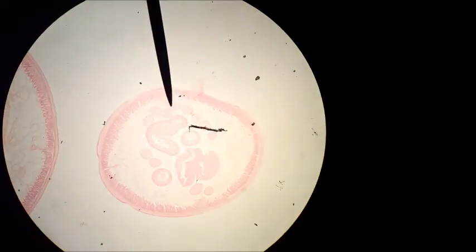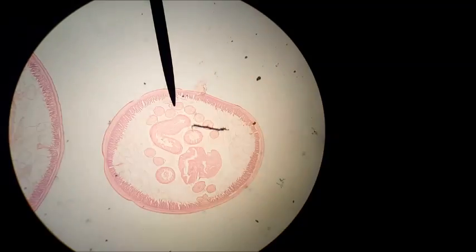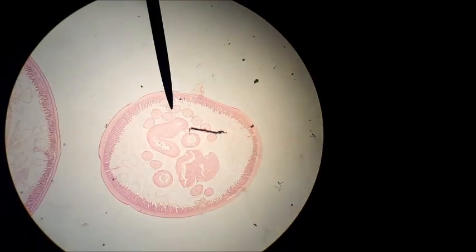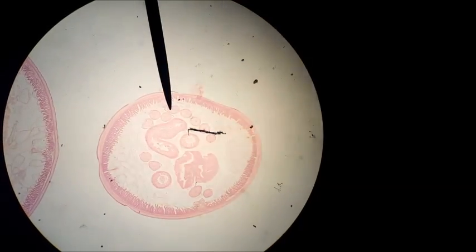They have a pseudocelom which indicates that they have an incomplete mesodermally lined body cavity. They are in the Kingdom Animalia, phylum Nematoda.